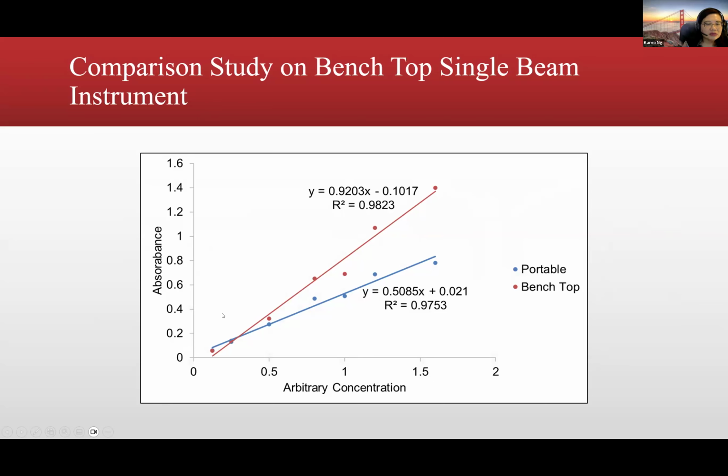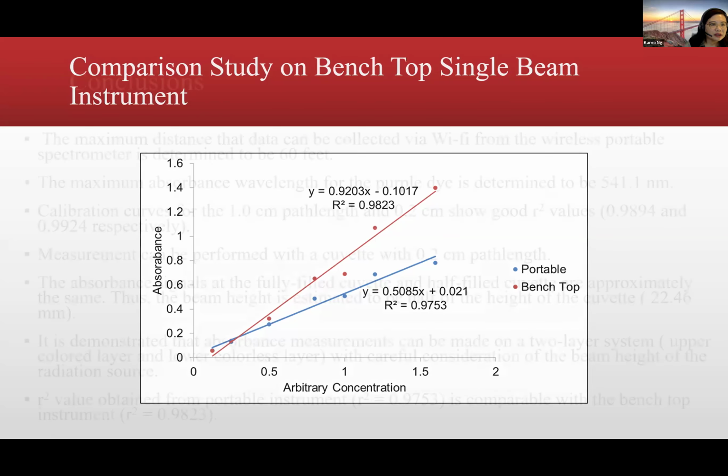From this study, we are convinced that the wireless portable spectrometer's performance is comparable with the traditional benchtop. Knowing this, we have the confidence to see if we can do the test for the abused drug.